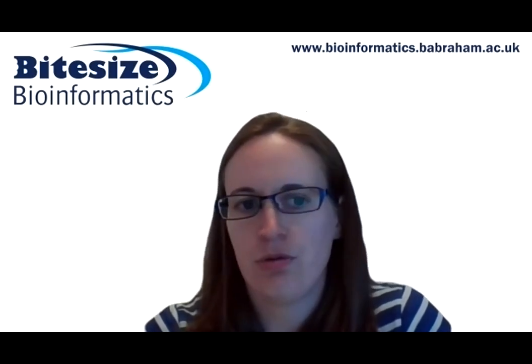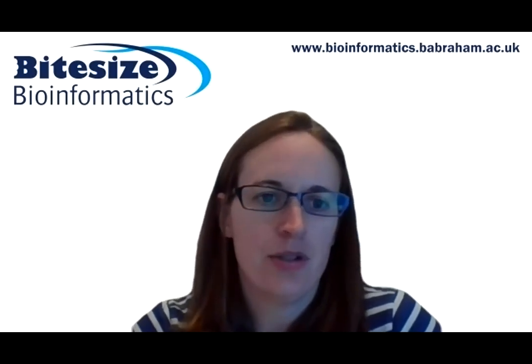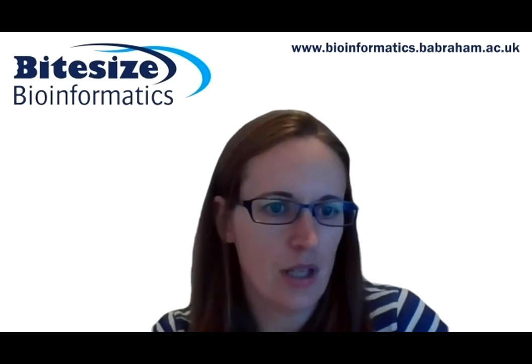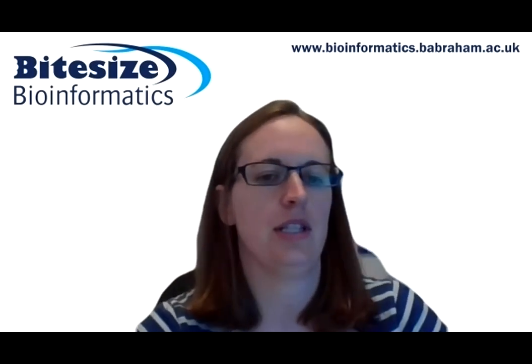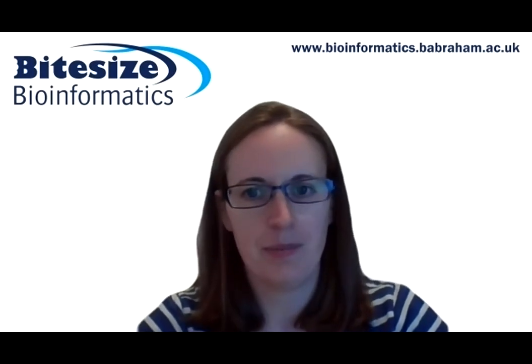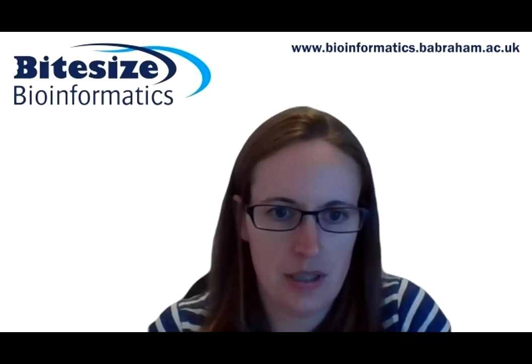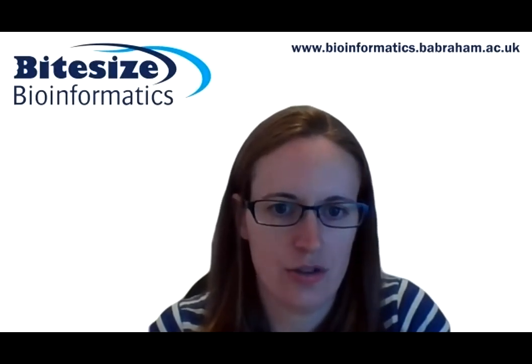There are plenty of freely available web applications to do this kind of analysis. And most of these tools offer something slightly different in the way of visualization, the statistics used, or the range of data sets or annotations used as the set of functional categories to test against. I'll come back to this again shortly. But for now, I've picked three tools here that I've put the same set of 200 genes through.